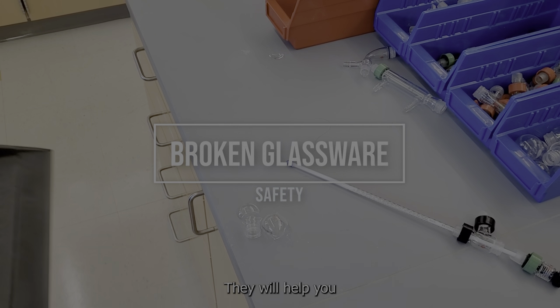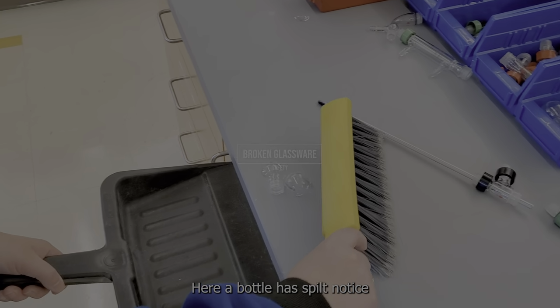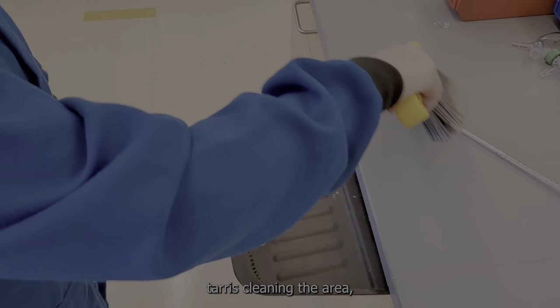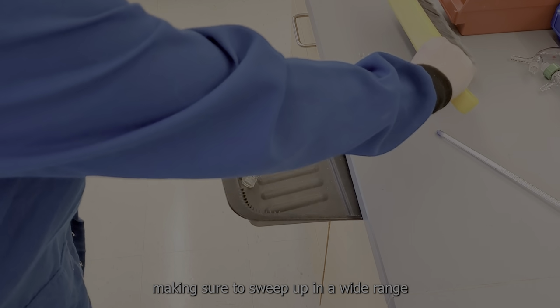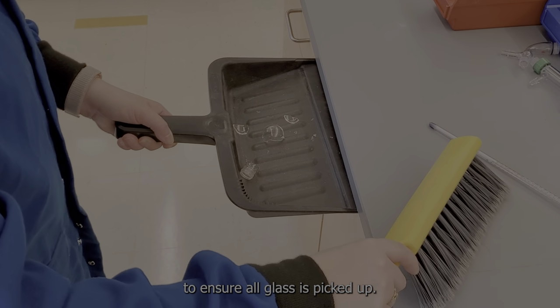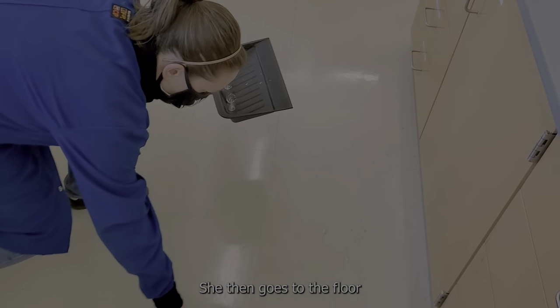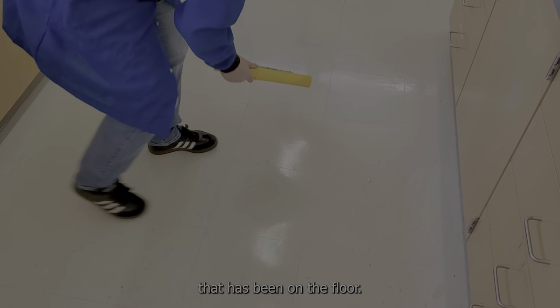If you break any glassware, please let your TA know ASAP. They will help you clean up the situation. Here, a bottle has spilled. Notice, Tara is cleaning the area, making sure to sweep up in a wide range to ensure all glass is picked up. She then goes to the floor to get any glass that has been on the floor.